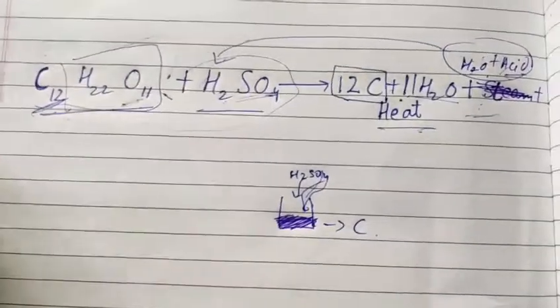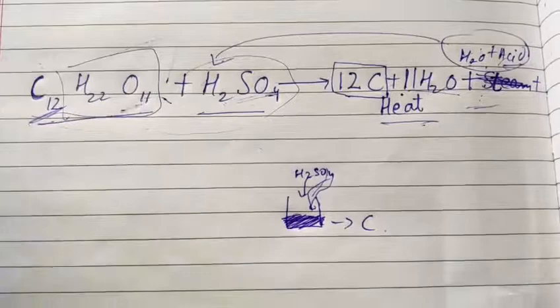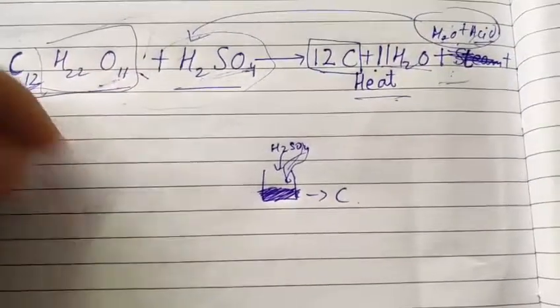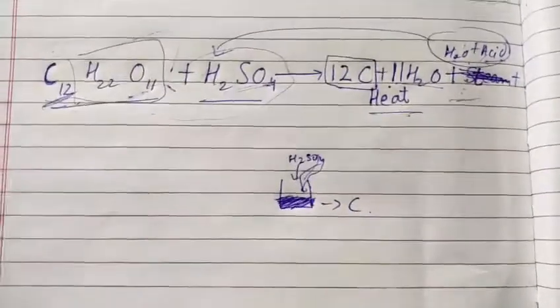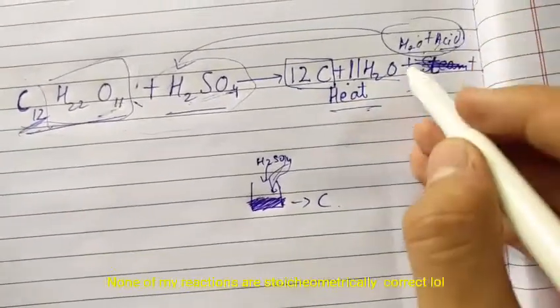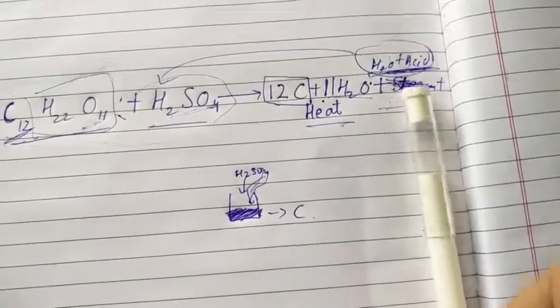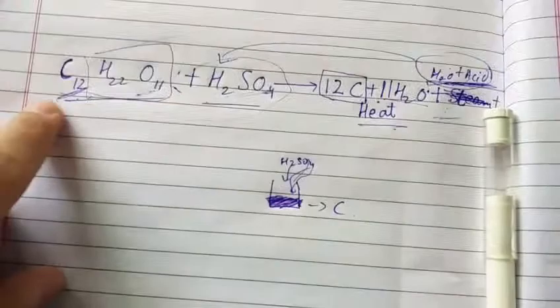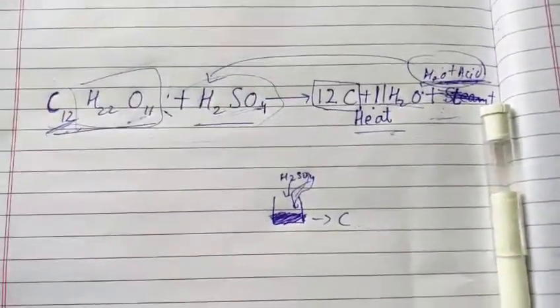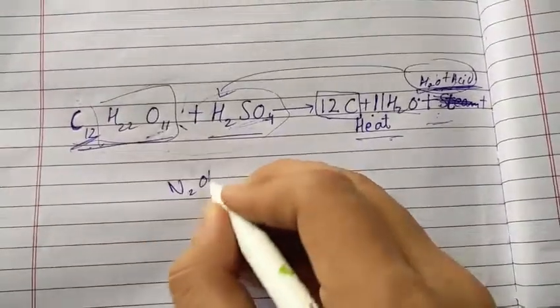Some sulfuric acid still in the drain and it hurts my fingers. The reaction is now over and you can start cleaning up. So I'll do that right now. The responsible chemist's job is to clean the beaker. I tried and I just can't get these out. Be careful which container you use.